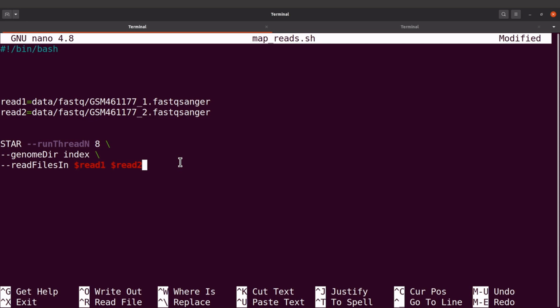And you can also combine the for loops with some Linux commands to get all the files and then process them. So if you are interested to learn about how to automate scripts or how to run mapping activities when you have multiple samples, we have lots of samples, you can always reach out to me and we can have a session together.